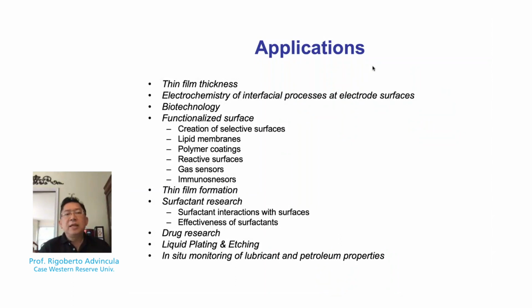In biotechnology, again, labeling and looking at specific and non-specific adsorption of molecules towards enzymes, or looking at very strong interaction, let's say, between biotin and streptavidin, or looking at vesicle formation. Those are some of the things that QCM has been utilized for in biotechnology.